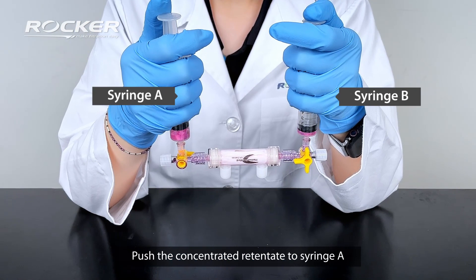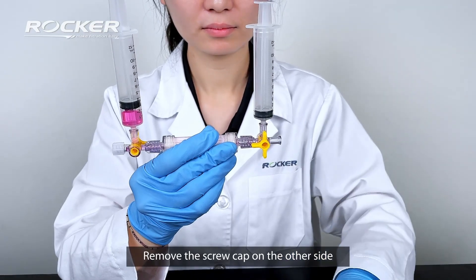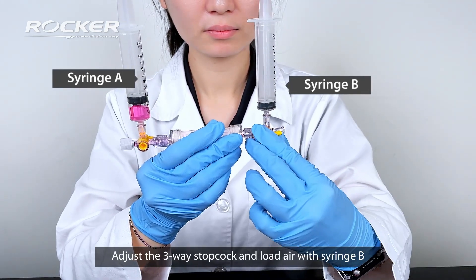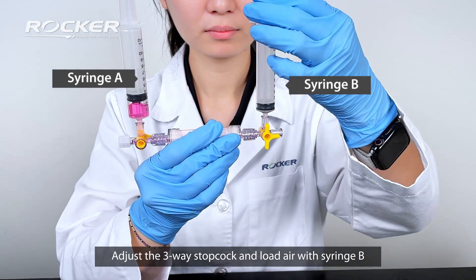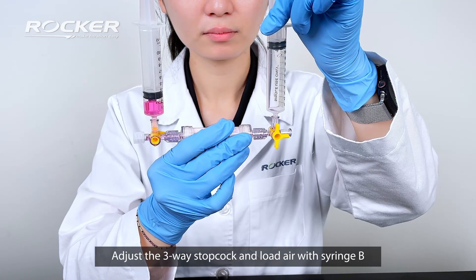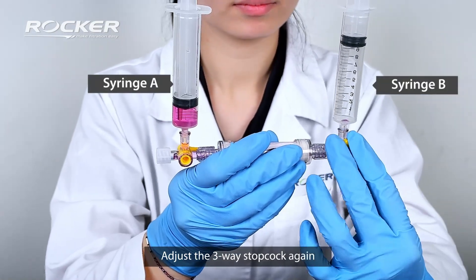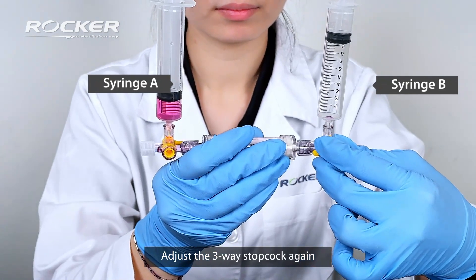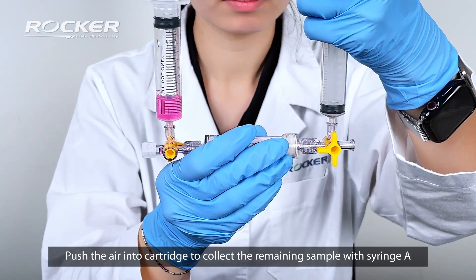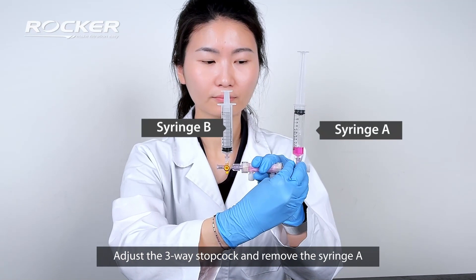Push the concentrated retentate to syringe A. Remove the screw cap on the other side. Adjust the three-way stopcock and load air with syringe B. Adjust the three-way stopcock again. Push the air into the cartridge to collect the remaining sample with syringe A. Adjust the three-way stopcock and remove syringe A.